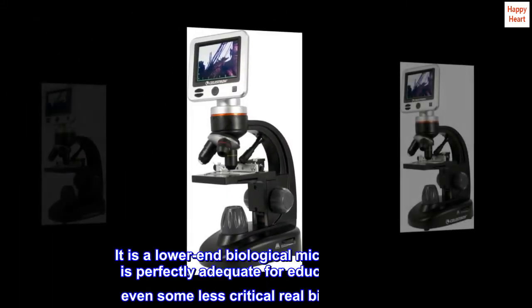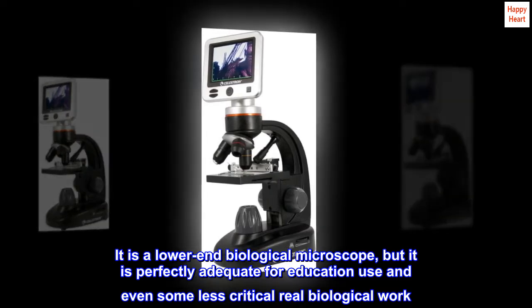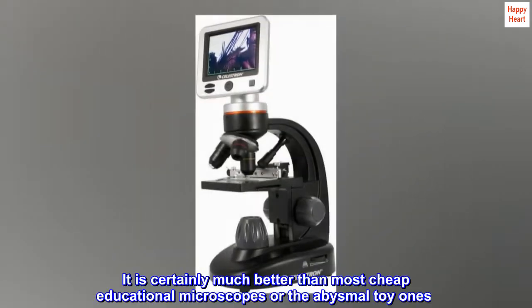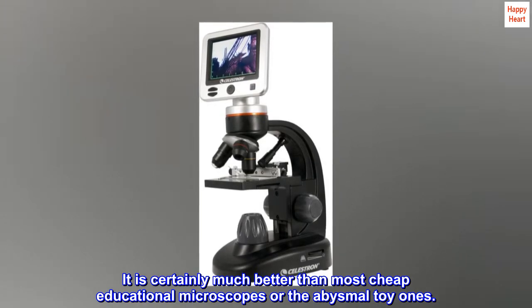It is a lower-end biological microscope, but it is perfectly adequate for educational use. It is certainly much better than most cheap educational microscopes or the abysmal toy ones.